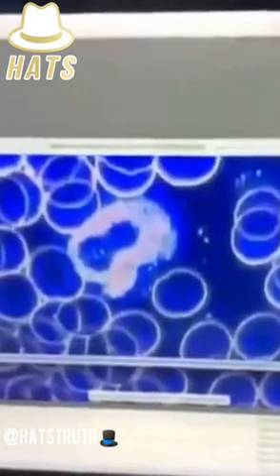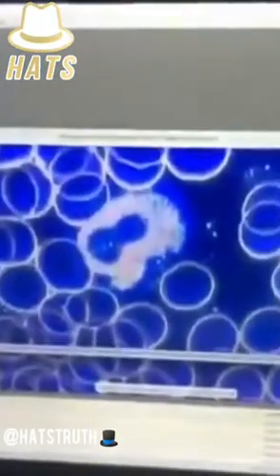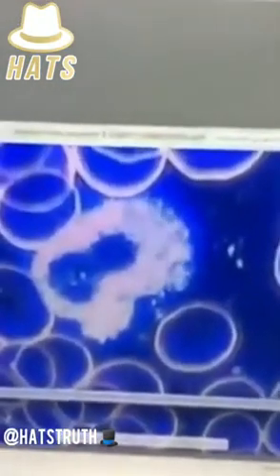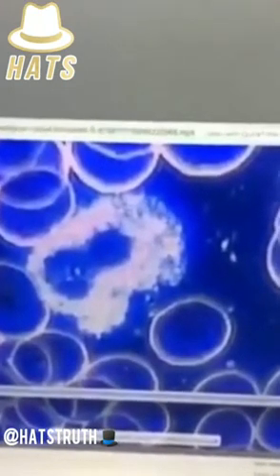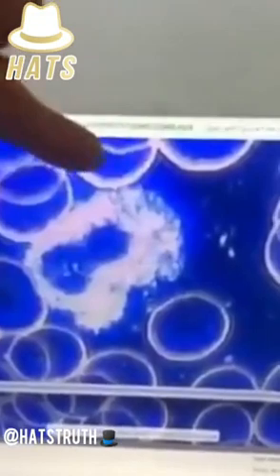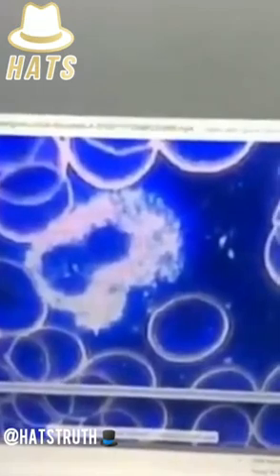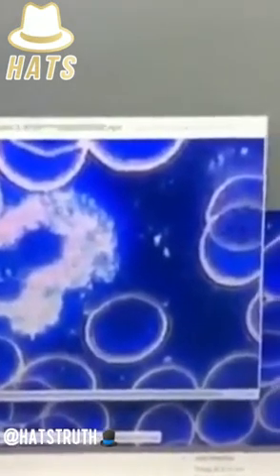So this one is a video. Let's enlarge it. This is actually really difficult to explain because it's a white blood cell, but also here very unusual how it comes out. It's not normal to look at this, and these overactive movements in this cell. I would say this is a cell that reacts to something toxic or something it wants to defend from.